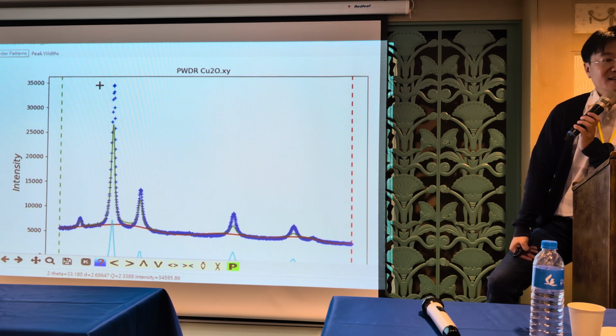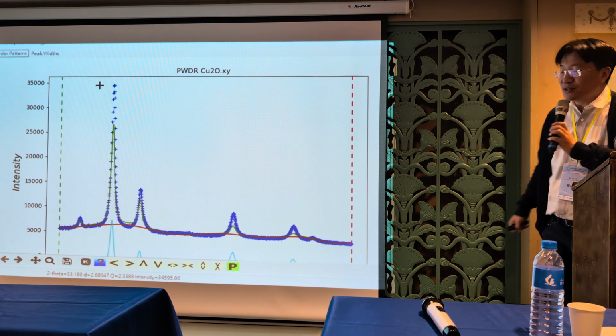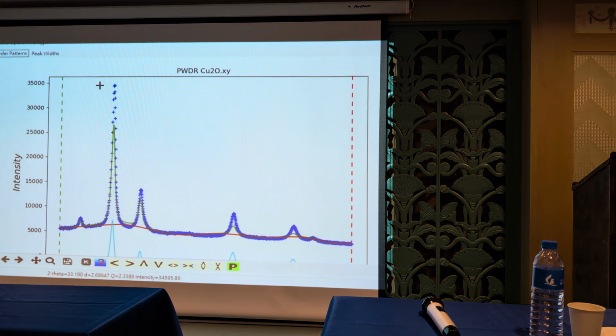OK，今天还有1个小时。啊？是2个小时。对，我本来预期是大家会带 notebook 来，我可以带大家做了，然后所以我就没有准备很多。没有，先画电子密度的。So I will show you how to plot the Fourier transform electron density map.